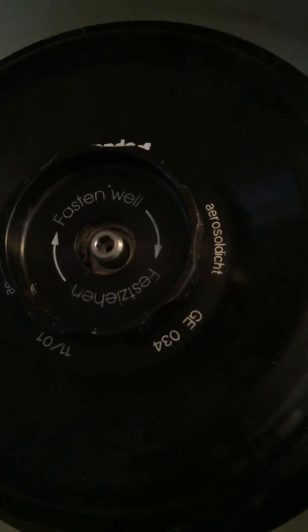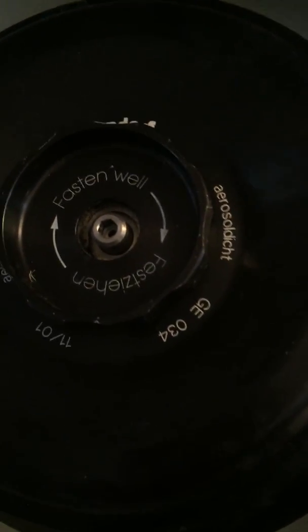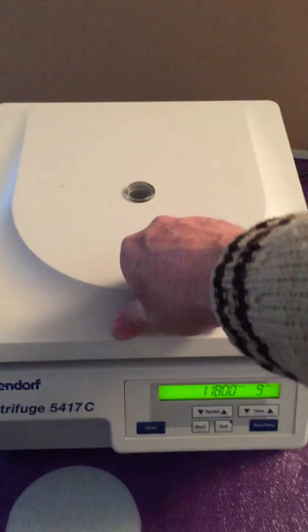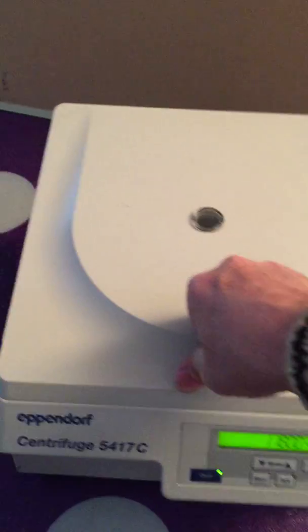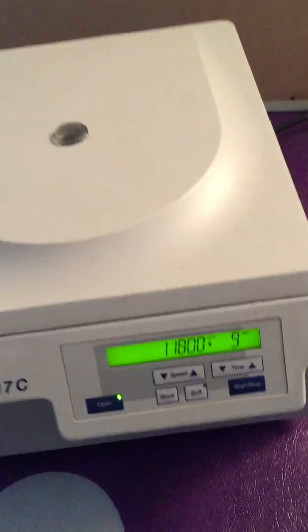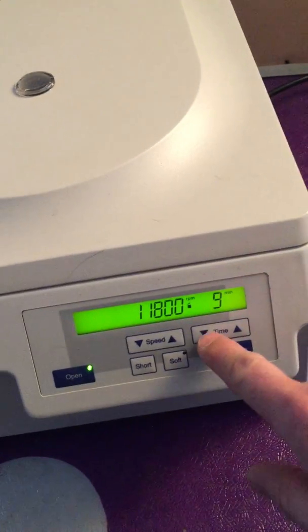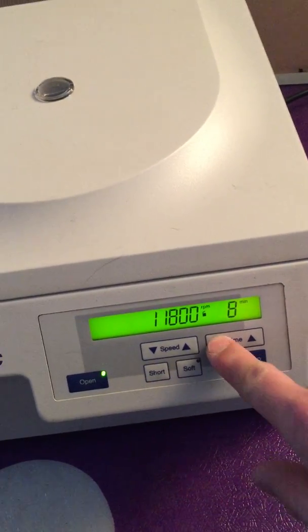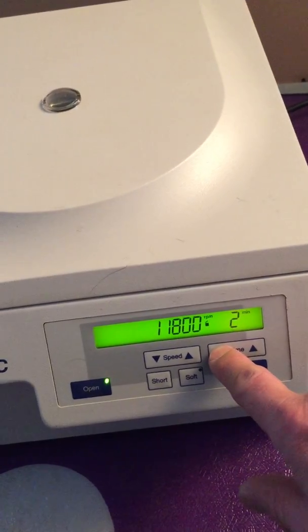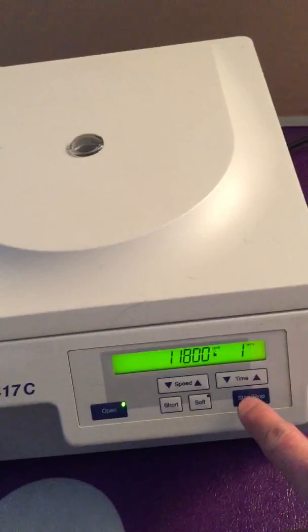It's got a G034 rotor. Let's close the lid now and then let's change the time. Let's go for a quick run.